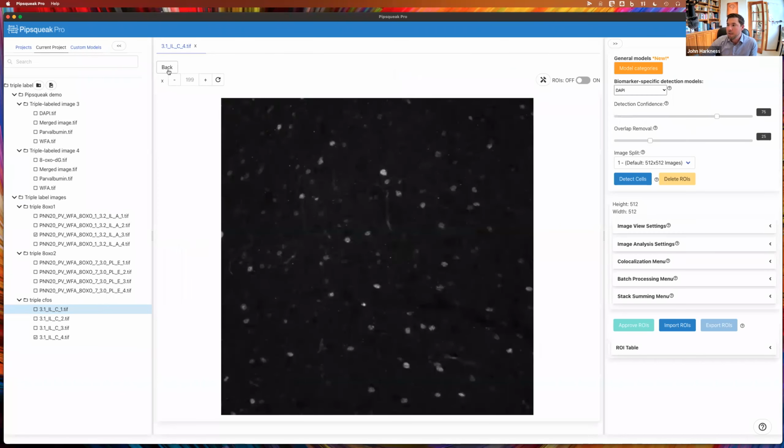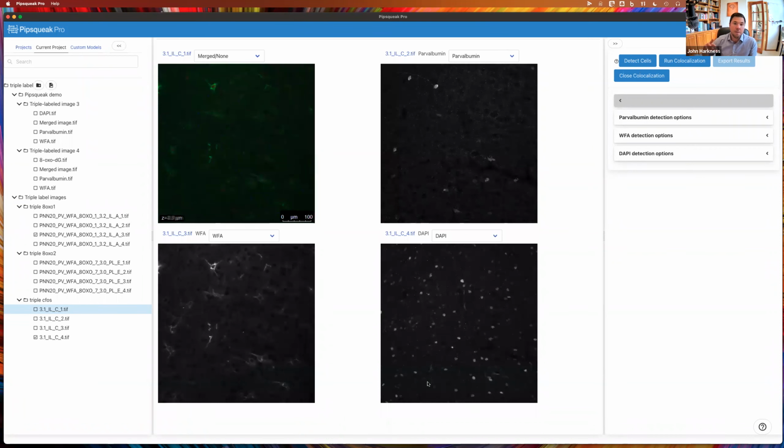And so, the method that I think a lot of people use for this is to flip back and forth between the images with all of your ROIs open in ImageJ. And if you've done that, I can tell you it's not a great experience. When you add in a third channel or a fourth channel or a fifth channel, I think that co-localization becomes impossible to do by hand as a person. And so here, our software does this really well.